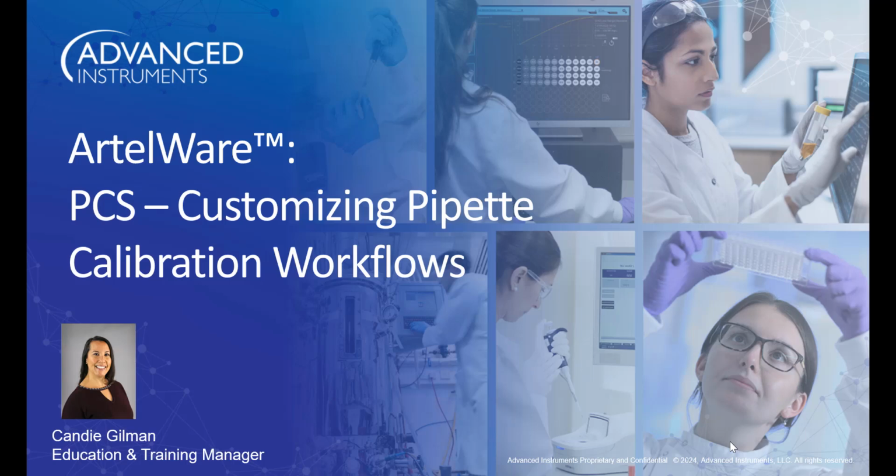Thank you for joining me for this brief tutorial focused on customizing pipette calibration workflows for use with the PCS and the ArtelWare application. I have a lot of information to share with you, so let's go ahead and get started.